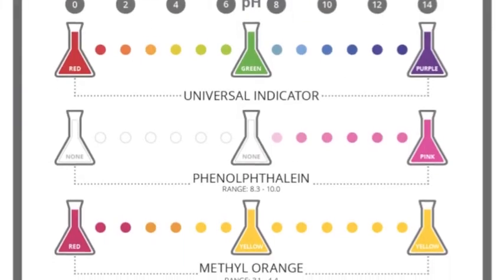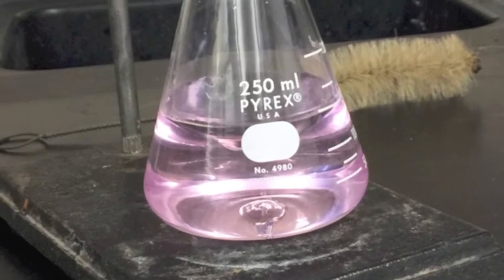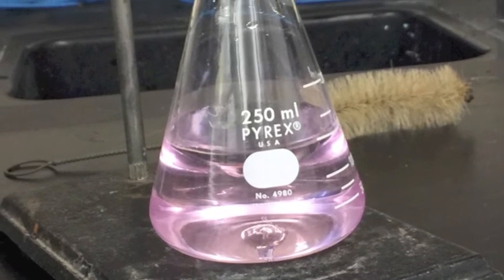The indicator phenolphthalein was used because it was a weak acid-strong base titration. The article acid-base indicator states, adding hydroxide ions removes the hydrogen ions from the equilibrium, which tips to the right to replace them, turning the indicator pink.